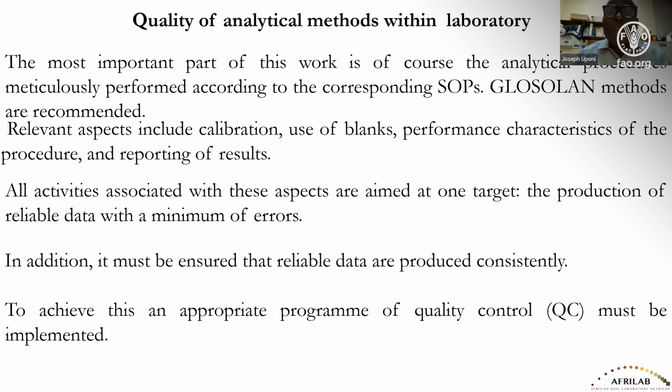There are different types of blanks. There are reagent blanks, there are instrument blanks. All those ones try to eliminate errors that are common to all the samples. Usually these are samples that just do not contain real samples, but contain all the reagents that we use for the analysis. The whole idea is to minimize the sources of errors.